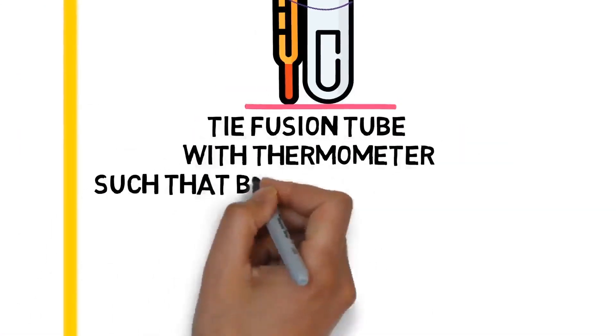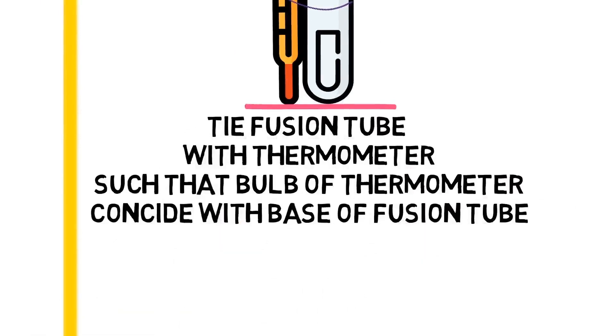Tie fusion tube with thermometer such that bulb of thermometer coincide with base of fusion tube.